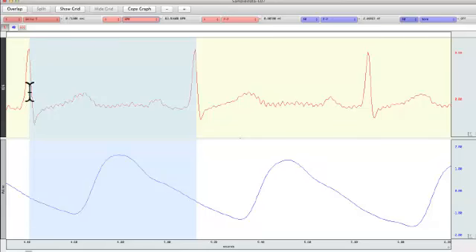Be aware again, as I mentioned before, that if you do this and you're measuring delta t, you still get a heart rate, or you still get a beats per minute, because all it's doing is dividing 60 by this number. So what you sweep out has to be relevant. The computer just takes the information you give it. So you have to be intelligent in your selection of information.